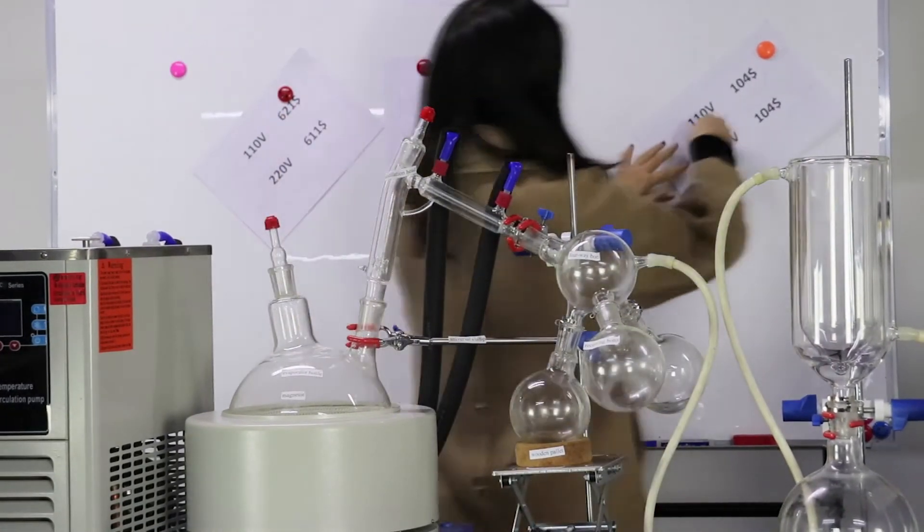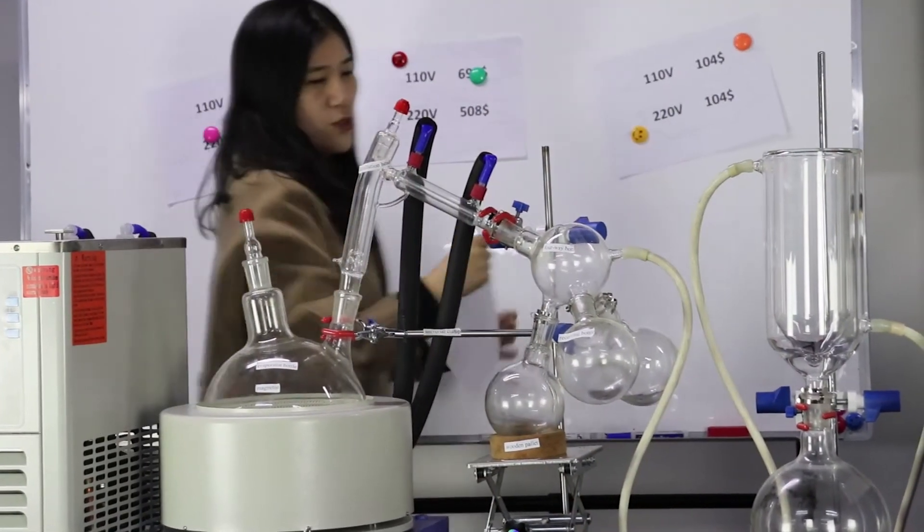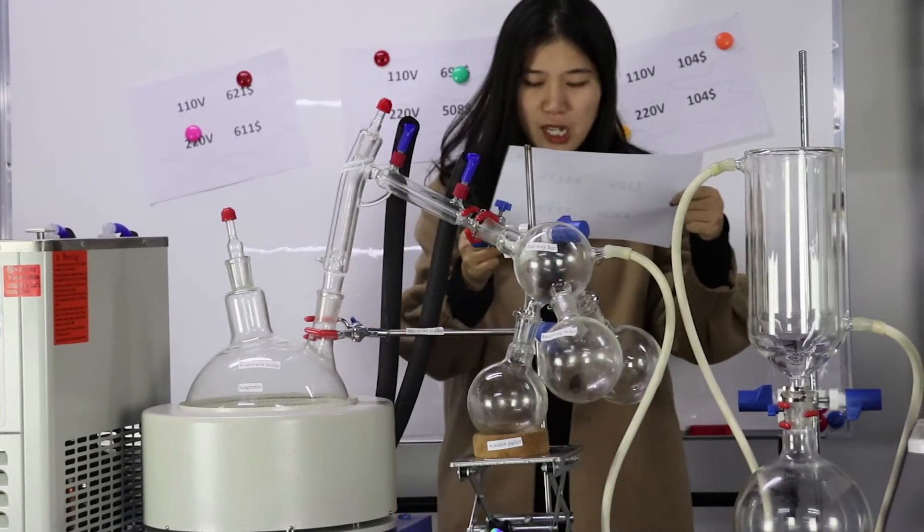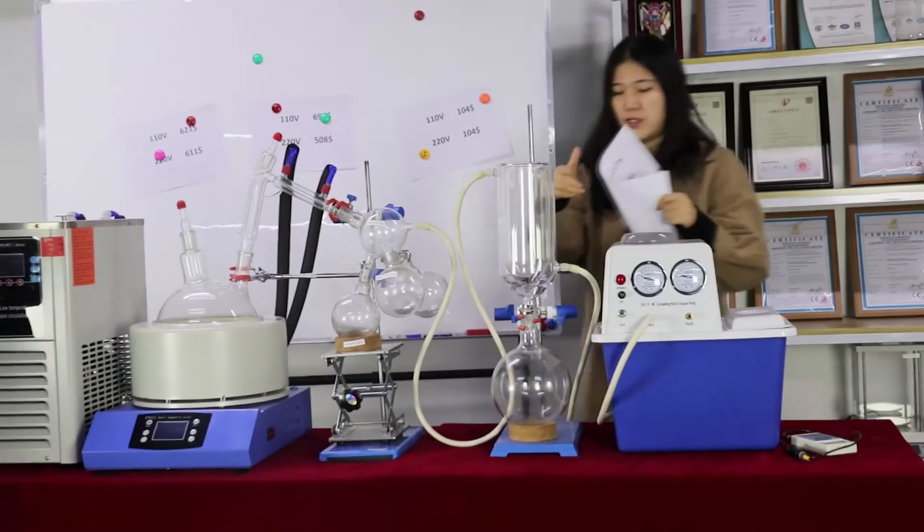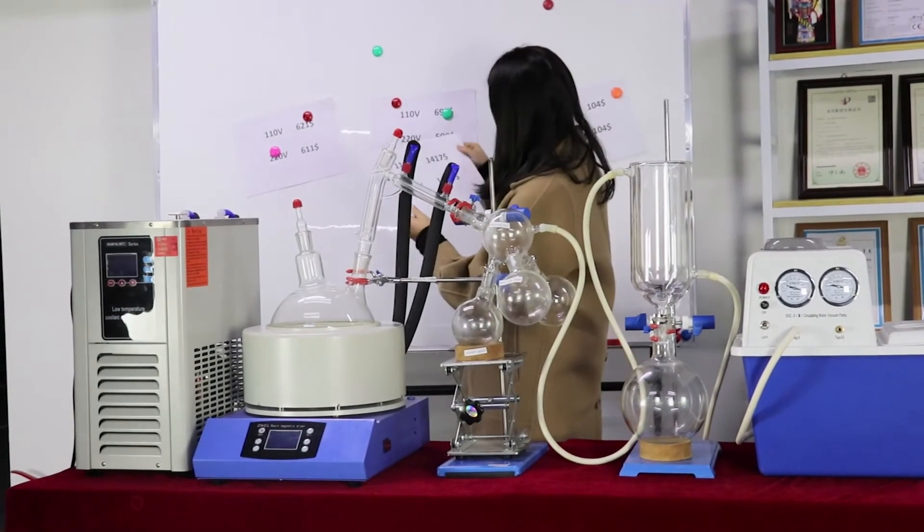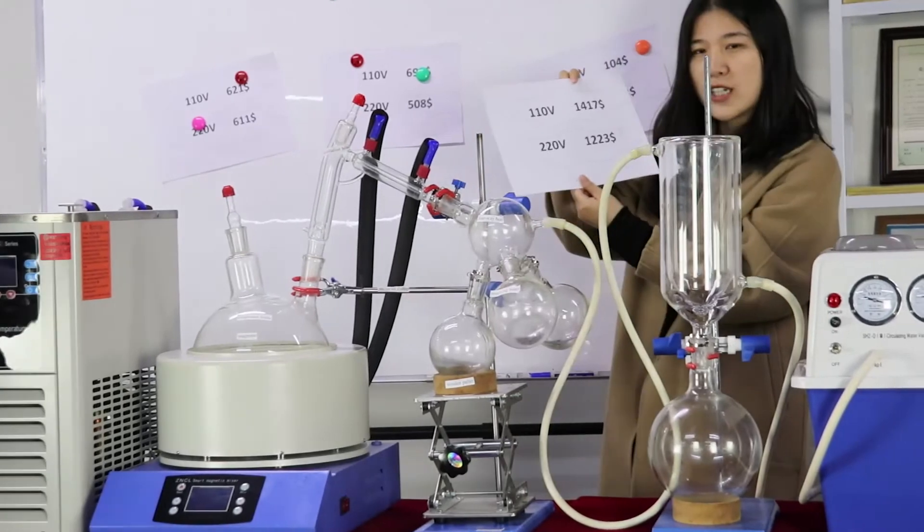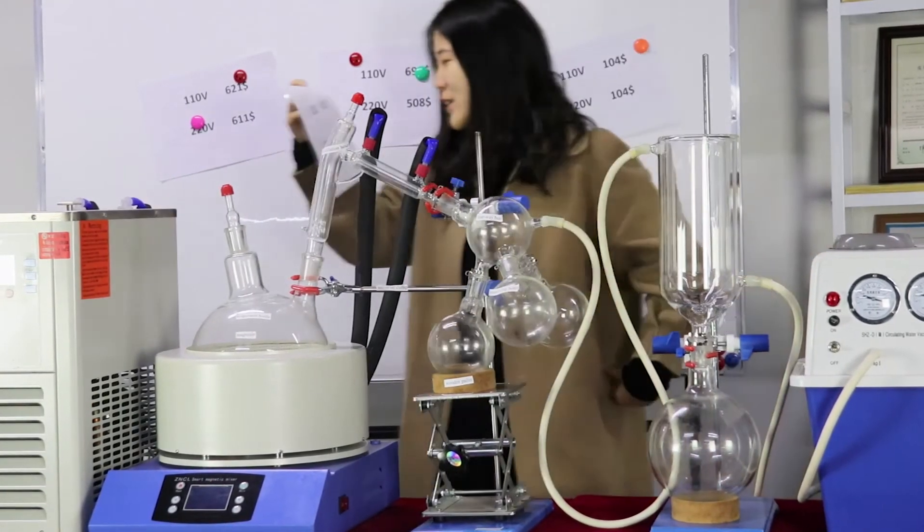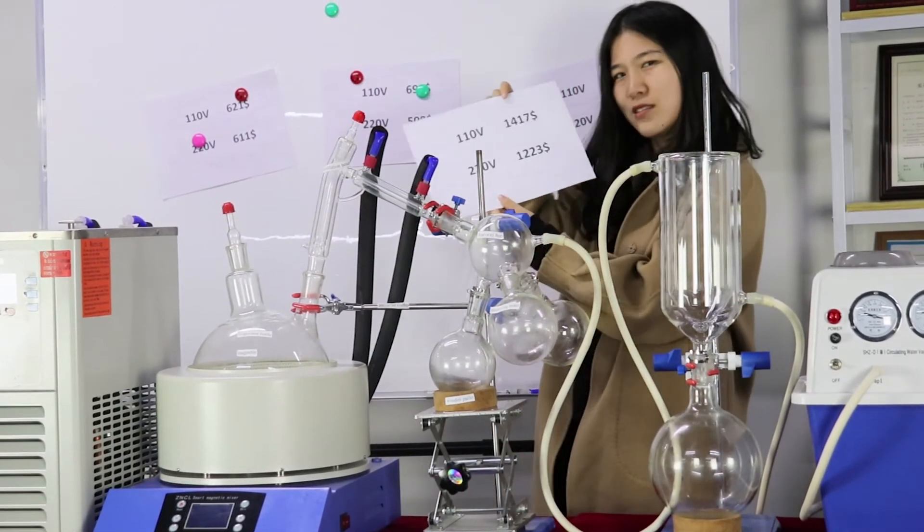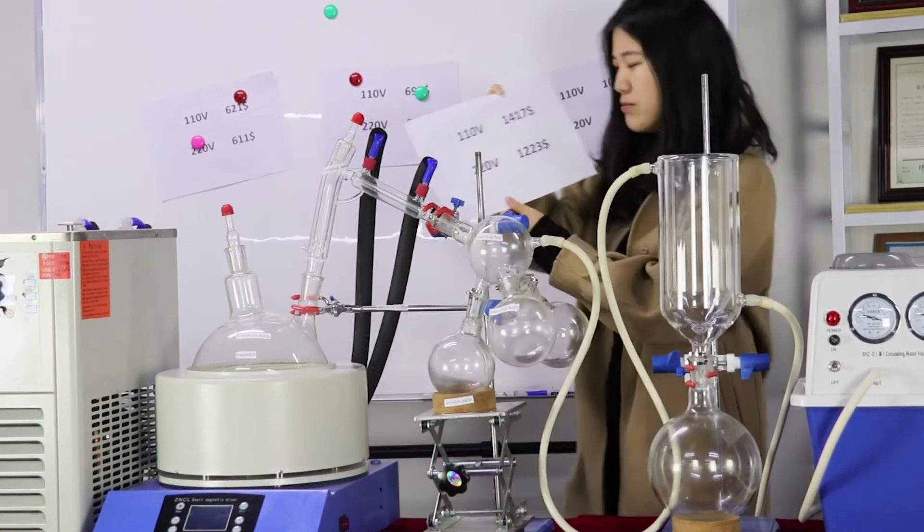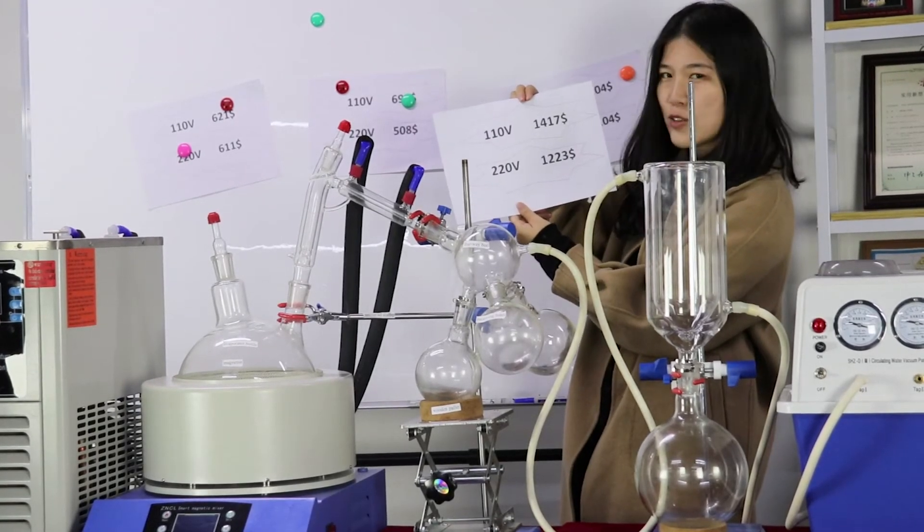How about the whole set? How about the whole set price? Very excited too. The whole set: chiller and the distillation system and the vacuum pump, you just need to pay $1,223. Do you get it? The whole set just needs $1,223.